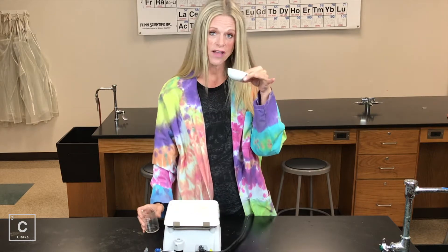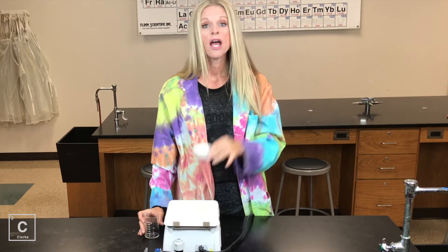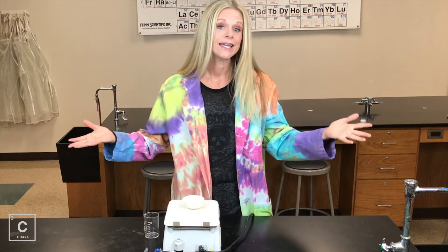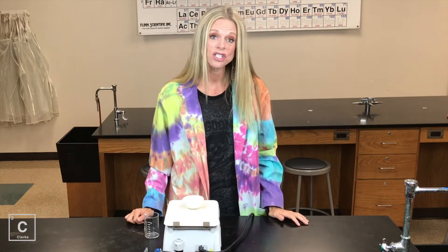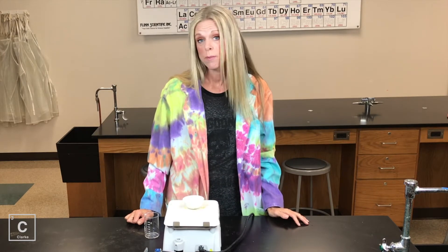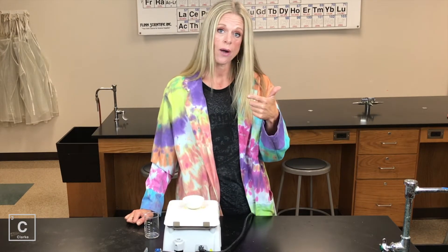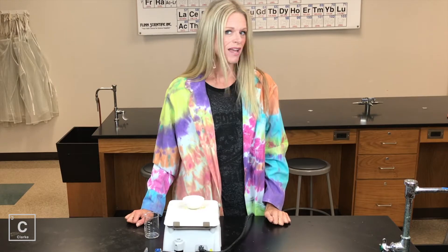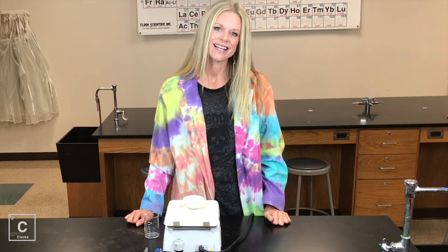We're going to use an evaporating dish. I'm going to ask you to sketch this apparatus, so make sure you have your notes and something to write with. When you get those, make sure and come back and let's get started.